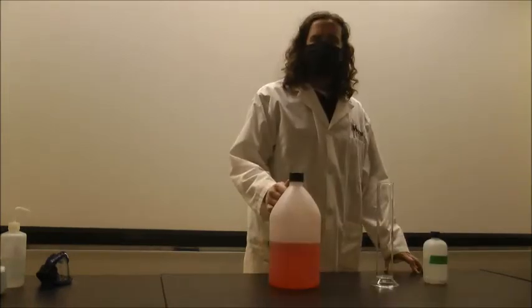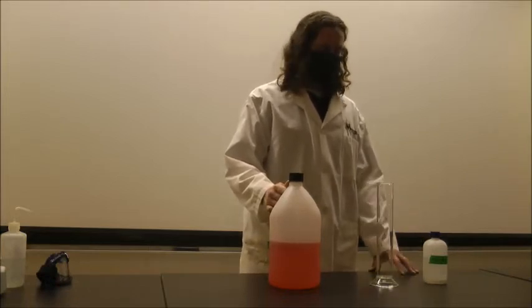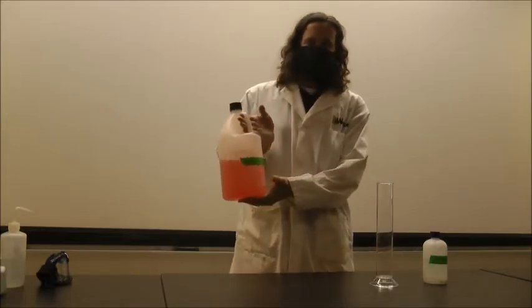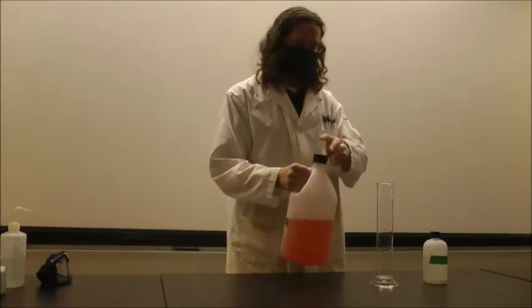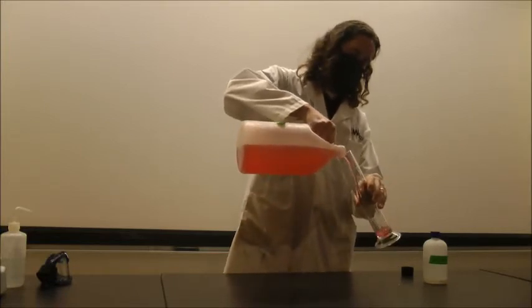Watching the pH change as we breathed into that bottle was pretty cool, but I think there are some cooler things we can do if we're going to play around with pH. So once again, I have some water. This time this water is mildly acidic, and so it is red. So let's go ahead and pour some of that into our container here.